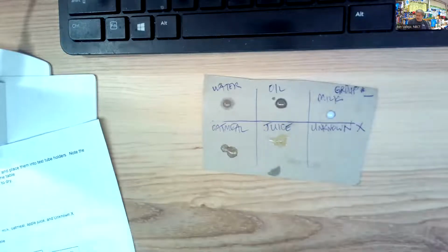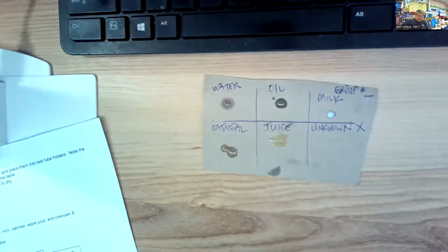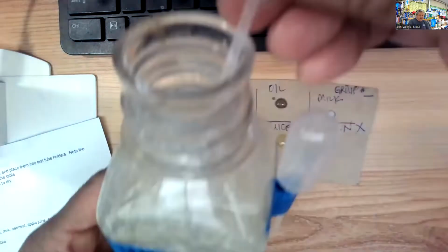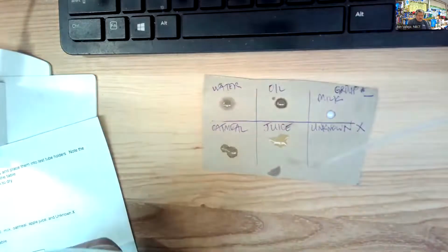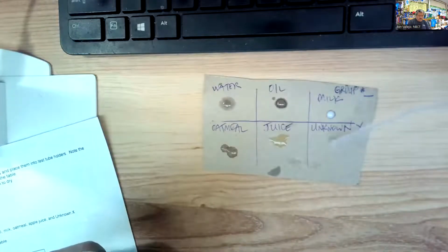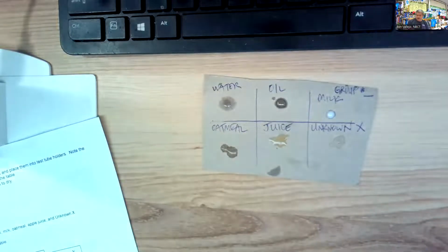Alrighty. And then a drop of the unknown. What is the unknown? Well, we don't know, but actually you don't know. I know because I made it. So that is the unknown X solution. Take that and drop it right there. There's the unknown X.